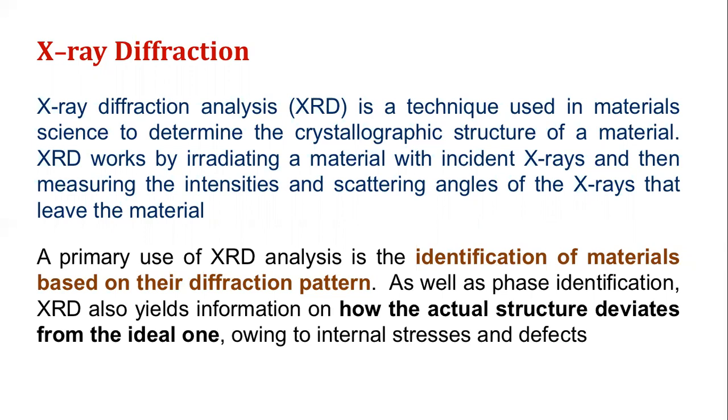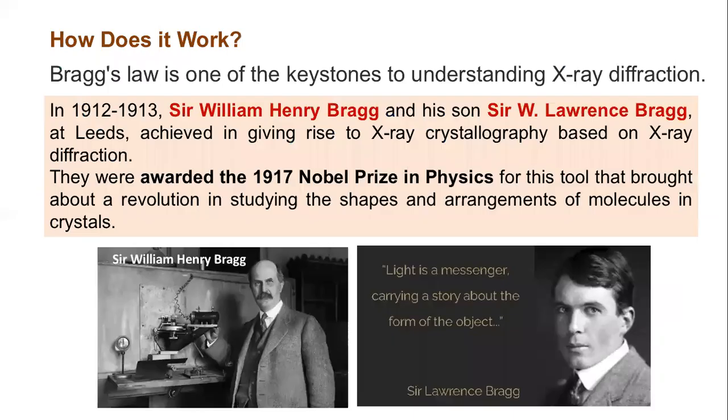It also helps us understand if there is any internal stress or defect which could lead to structural deviations, and these can also be identified using X-ray diffraction patterns. In the case of proteins, we can also study the conformational changes that could lead to a change in the structure of a particular molecule.